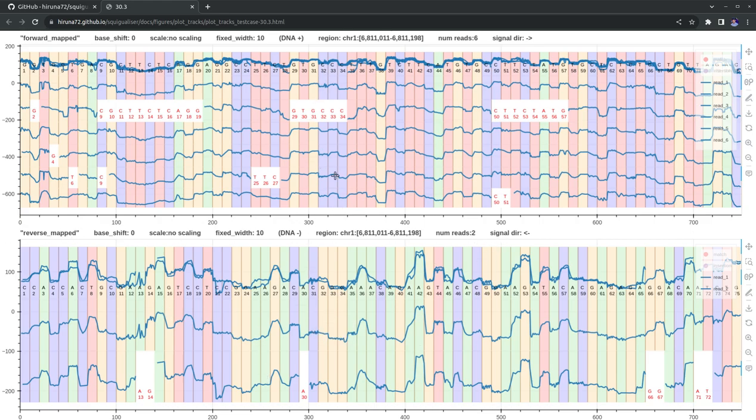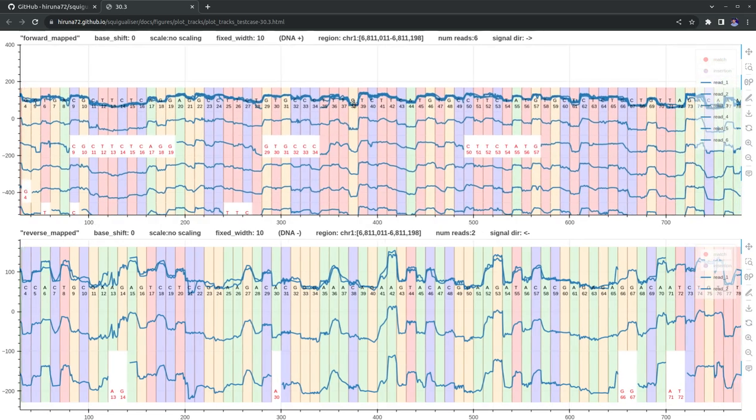All these signals are coming from the reads that map to this particular region here, and you can see there's a thick signal on top of each pileup. This is an overlap of signals. In this case, this has the overlap of 6 signals underneath, and this overlap has only the 2 signals underneath. The overlap is a powerful way to visualize the alignment right away.